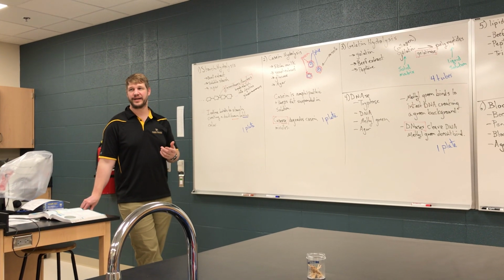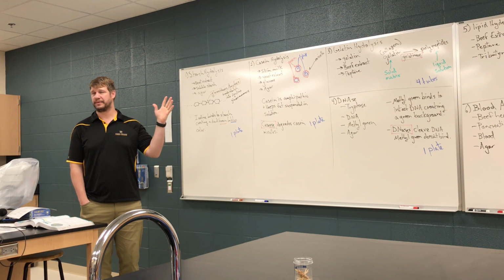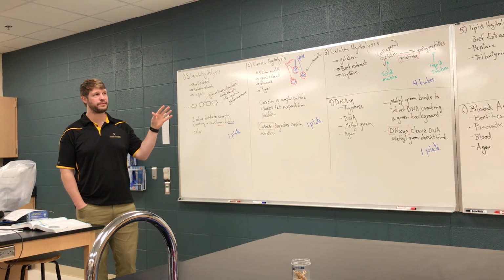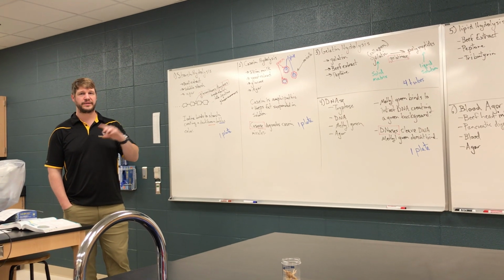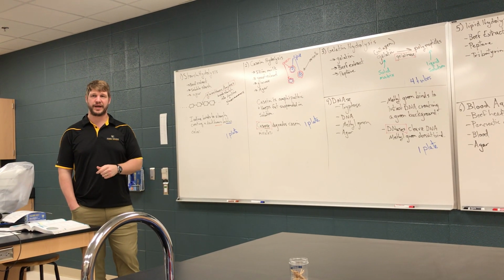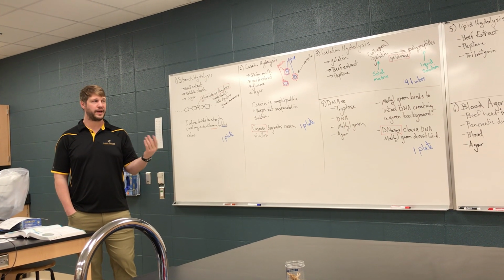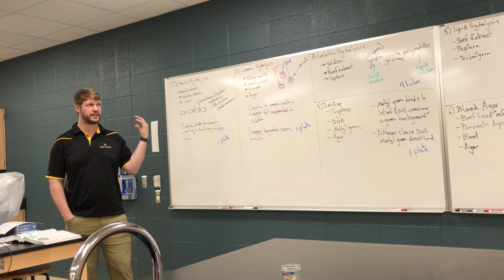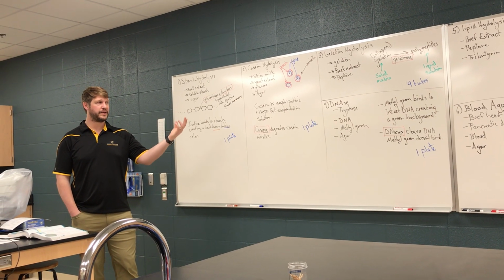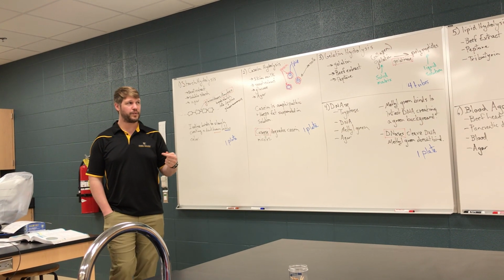So this week, basically we'll go through, I'll explain some of the differential media that we're using this week, and then after that, it's fairly straightforward. You'll be inoculating the plates and broths with your 4 organisms. The ELN this week is fairly straightforward as well, just basically describing and documenting each of these tests for each of your organisms and explaining how they work.